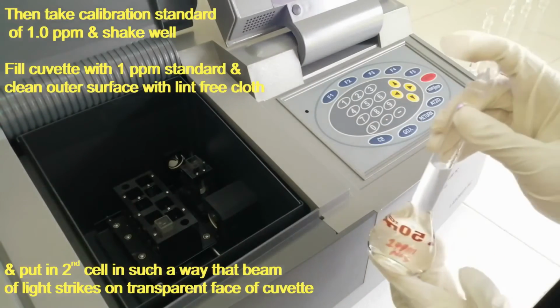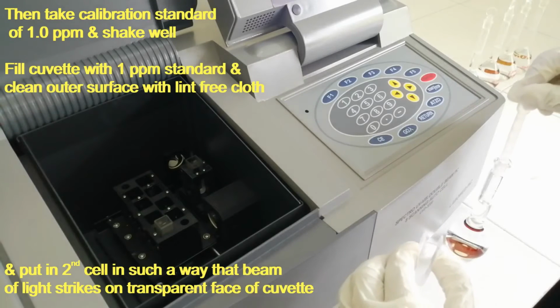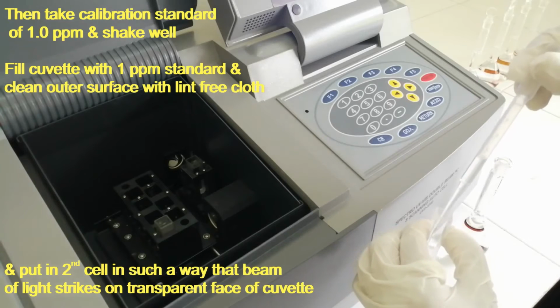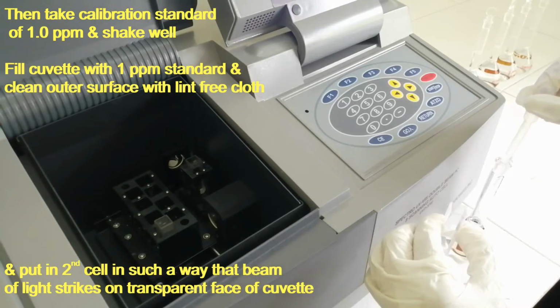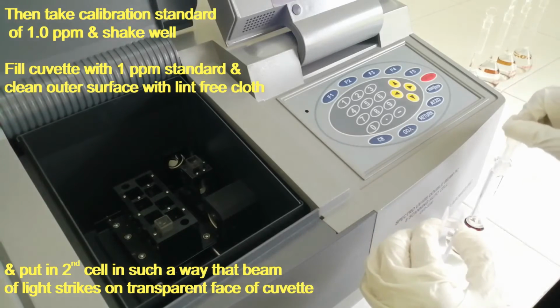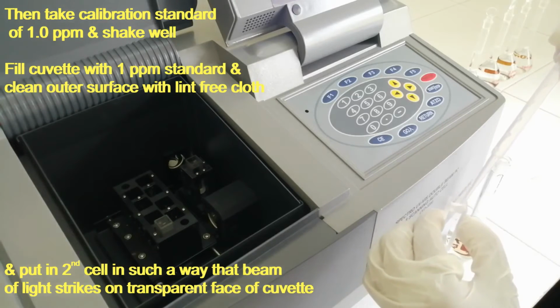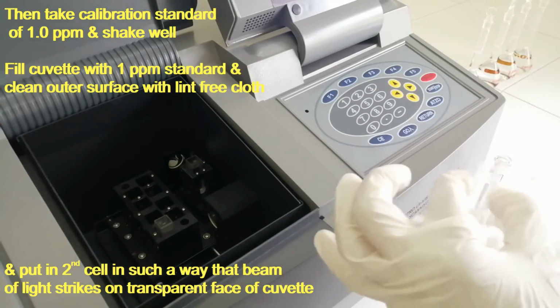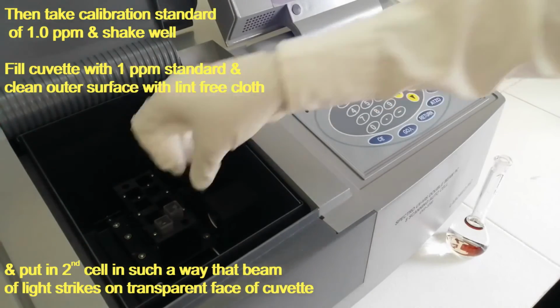Then take calibration standard of 1.0 ppm and shake well. Fill cuvette with 1 ppm standard and clean the outer surface with lint-free cloth. And put in second cell in such a way that the beam of light strikes on the transparent face of the cuvette.